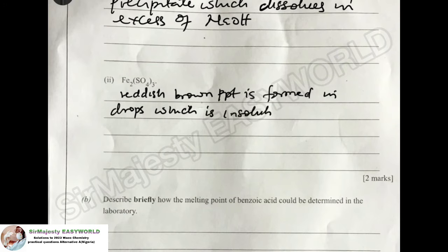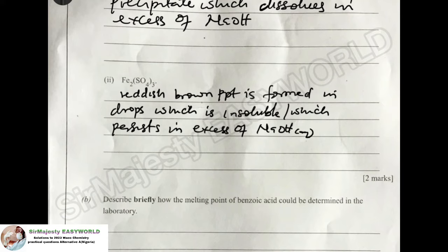This time around, insoluble. Or, if you don't want to say which is insoluble, you say which persists or remains in excess of NaOH aqueous.